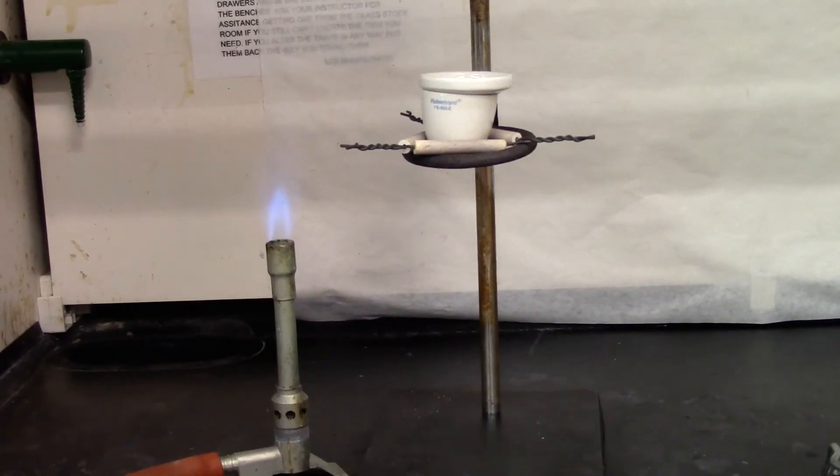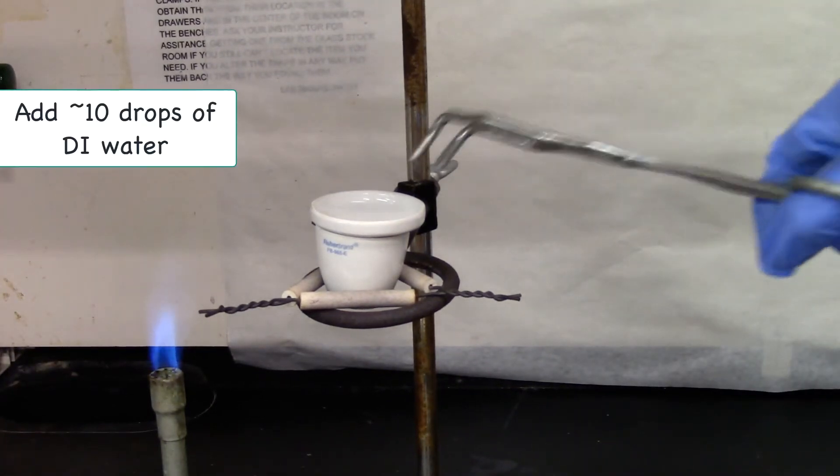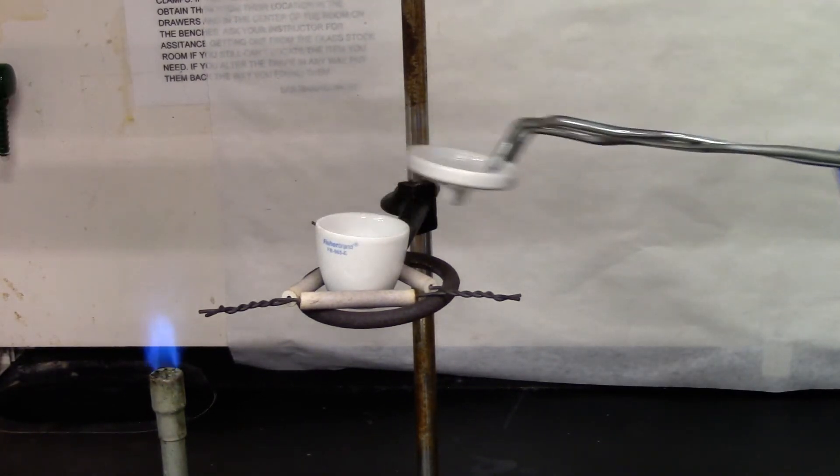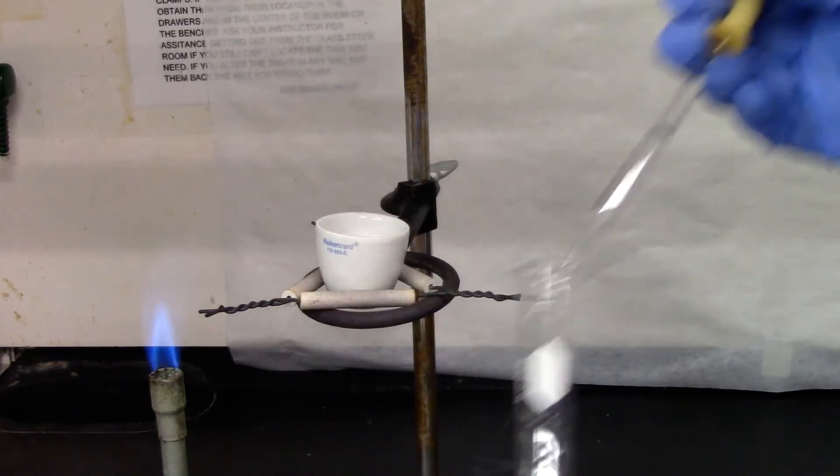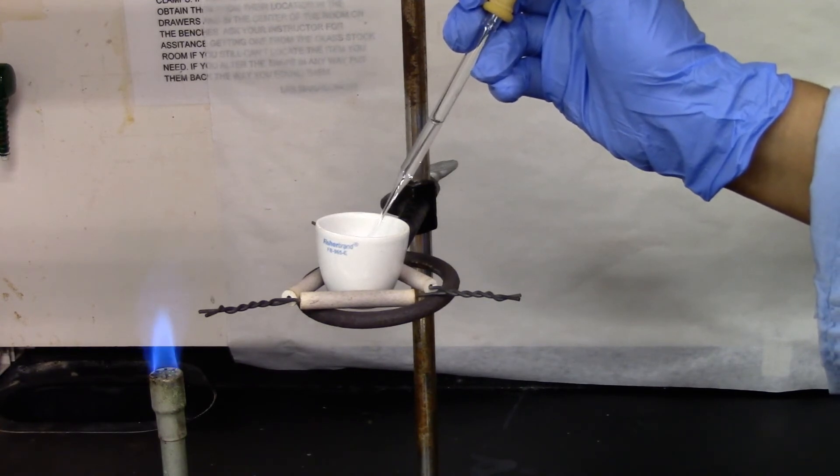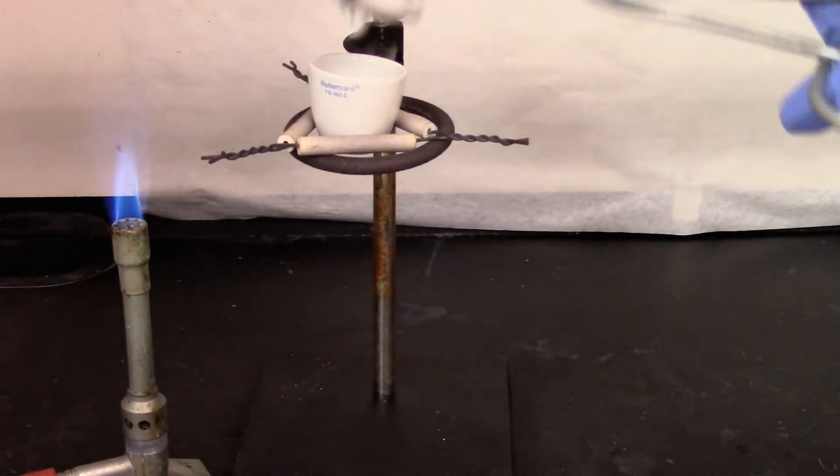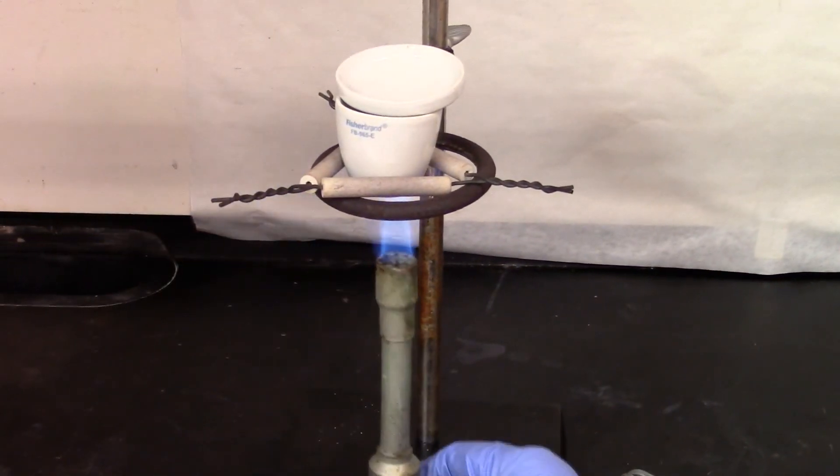I will let it cool for about 10 minutes and then add about 10 drops of water and then heat it again. So it's been about 10 minutes. I'm going to add 10 drops of DI water using a pipette. So now I'm going to put the lid back and then start heating for another 10 minutes.